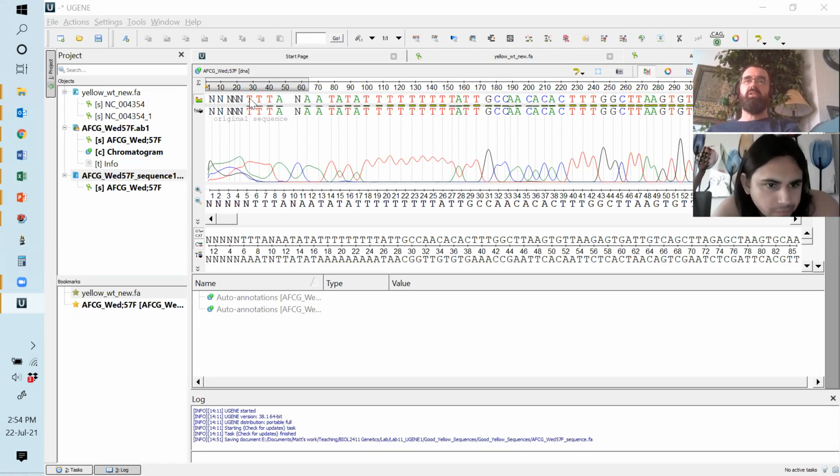Okay, so if you click on one of these, you're like, well, that's clearly not a T. I'm not really sure what that is actually. So you go through and you just do that for all of the ones which look suspicious.